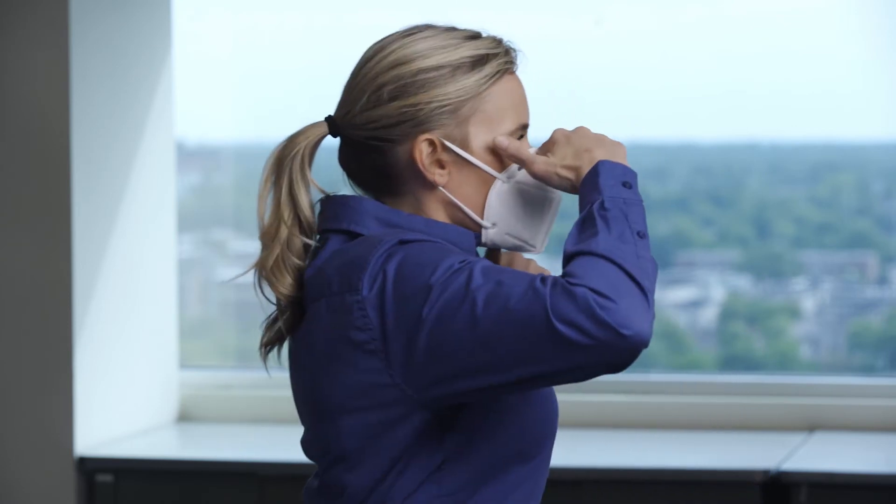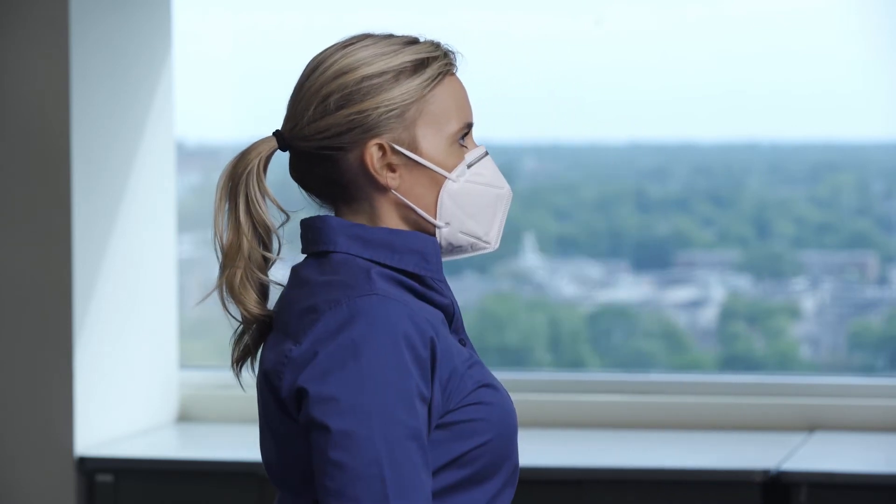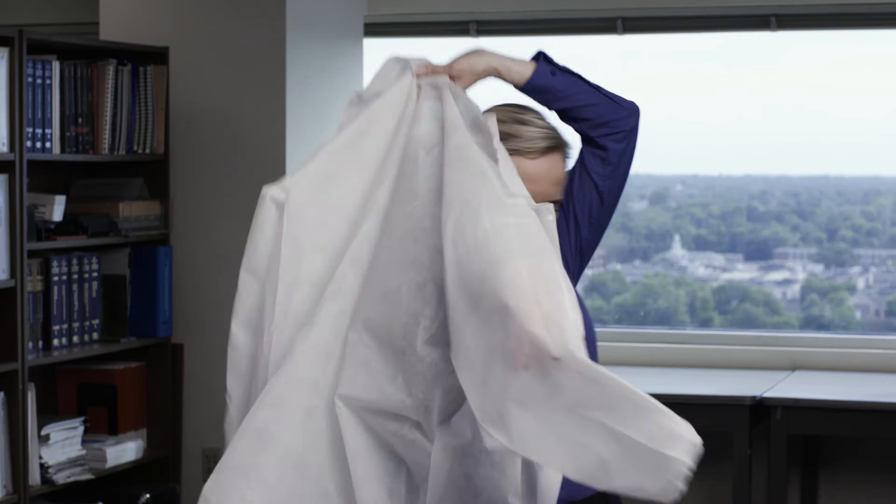For tight fitted masks, like an N95 respirator, you need to do a seal test each time you apply the mask to verify that a good seal has been created around your nose and face. Additionally, you should get fit tested annually for all tight fitted masks for optimum protection.